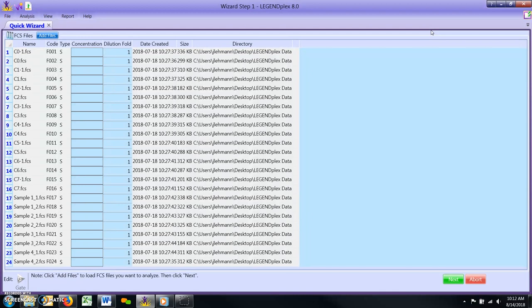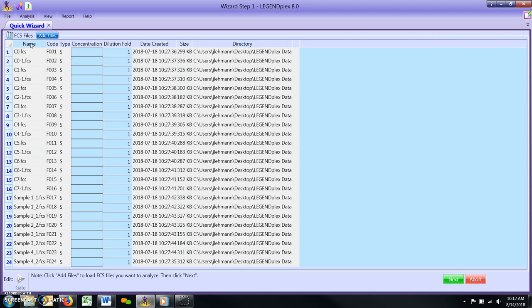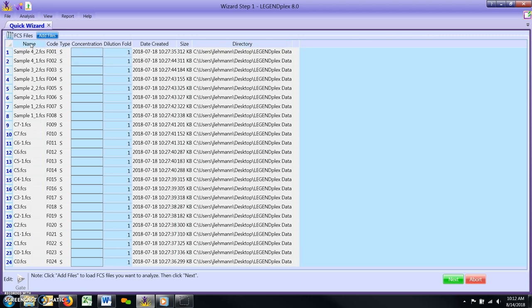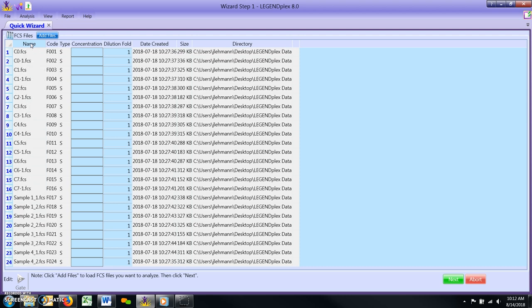Ordering FCS Files: After all files have been loaded into the Quick Wizard window, arrange the files so that your standard curve files are at the top of the list, followed by all unknown sample replicates. Click on the Name tab to sort the FCS files alphabetically. This option is usually sufficient to properly order the files, provided that you have followed the instructions in the assay manual, and named the files using a consecutive numbering scheme.